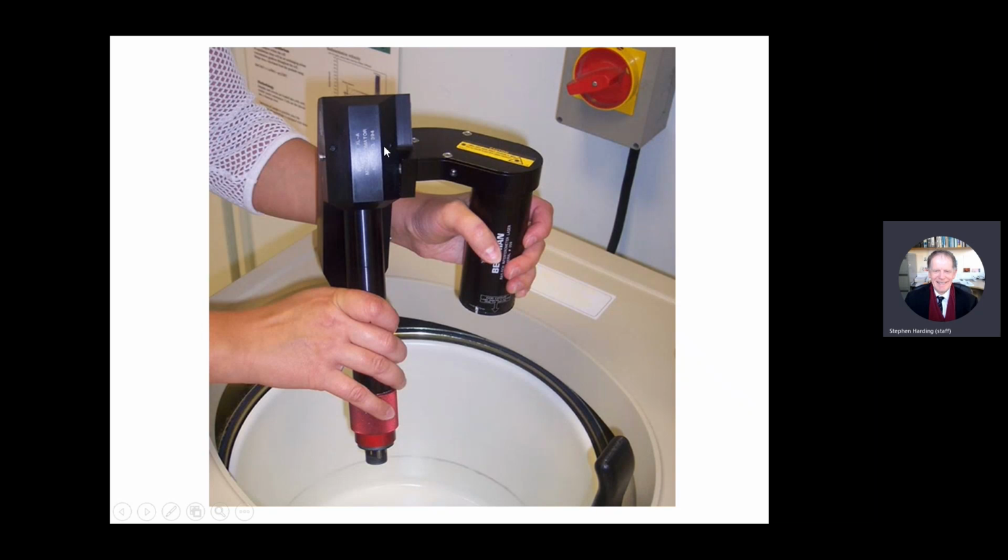Okay, we've also got this, which is a laser attached to the monochromator. So this shines laser light through a different cell, and this is for using what we call interference optics or refractometric optics, which can be applied to any type of macromolecule, not just proteins, where the monochromator is limited to usually proteins and nucleic acids.